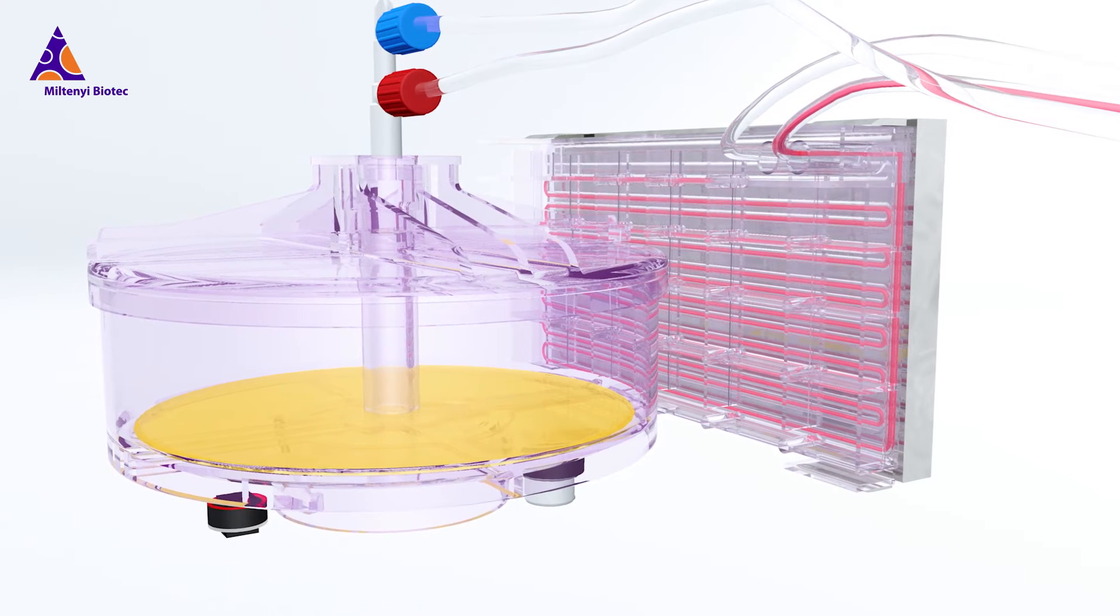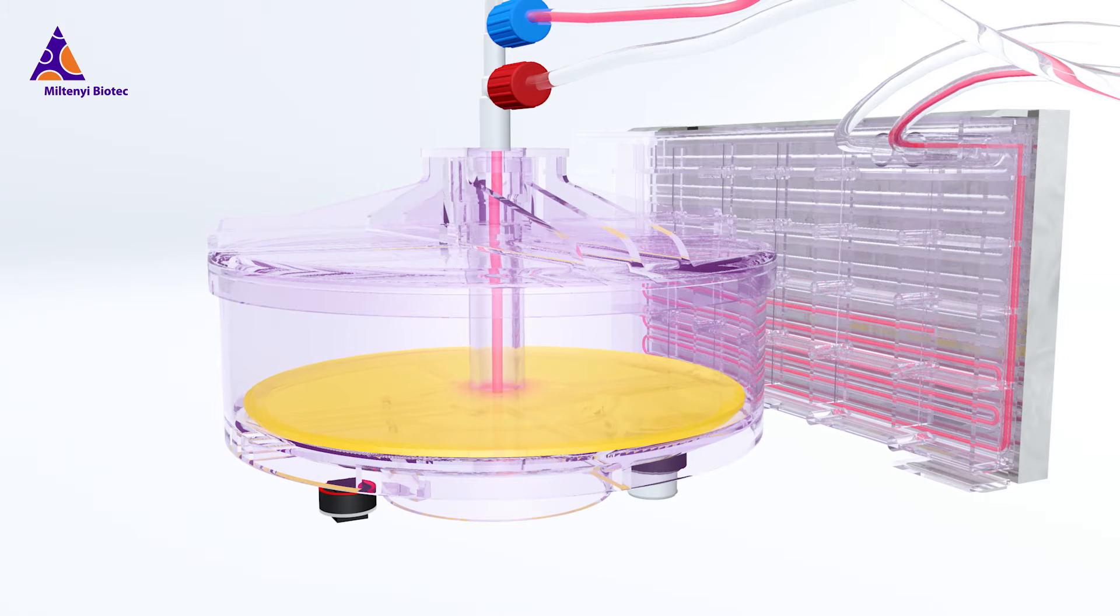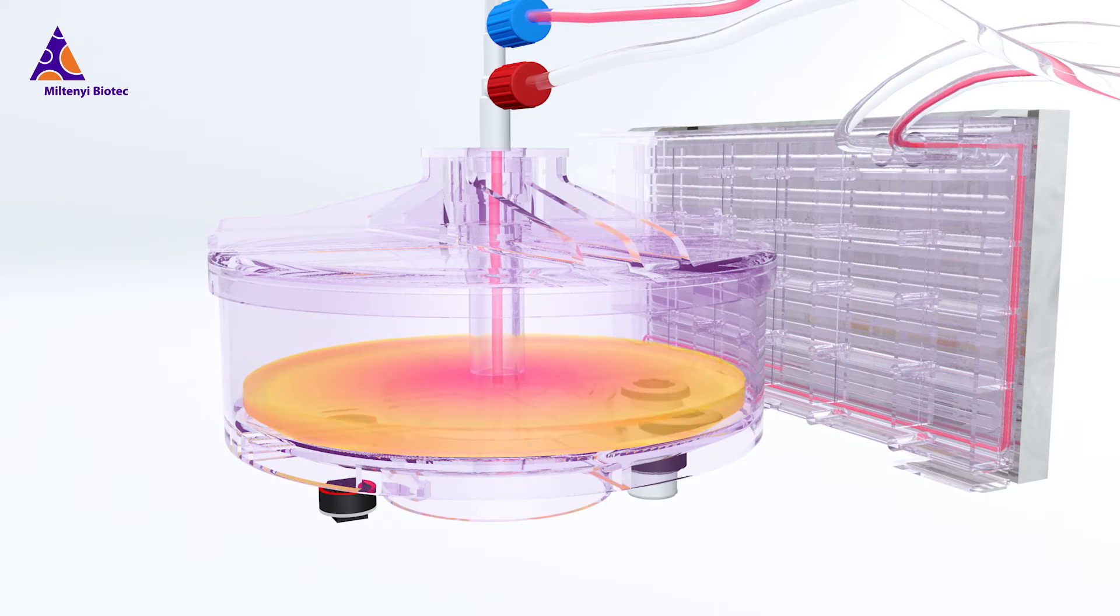The medium supply, as well as the whole cell culture process duration, are both flexible and programmable.